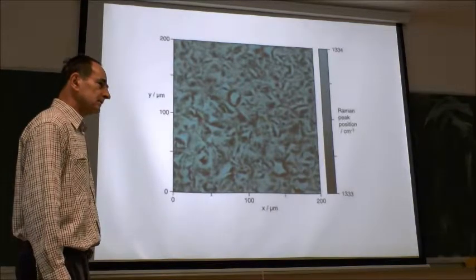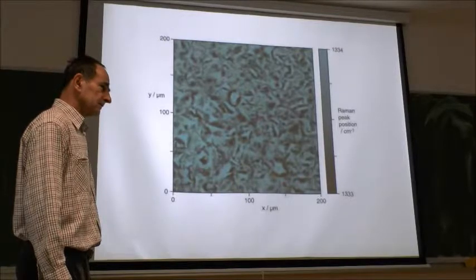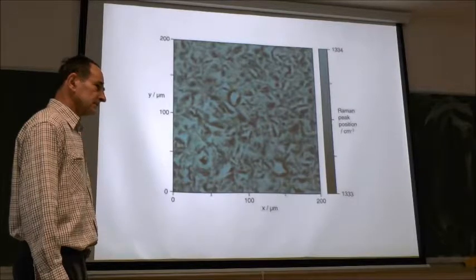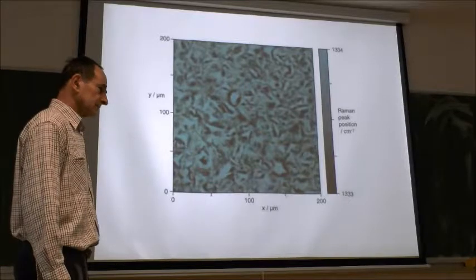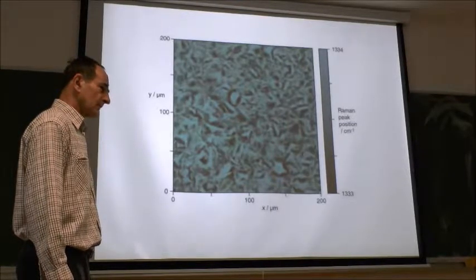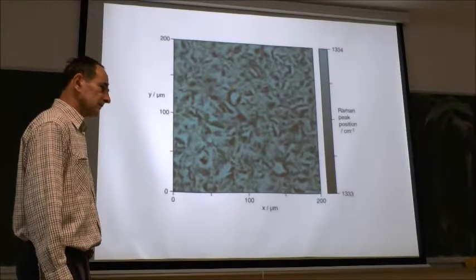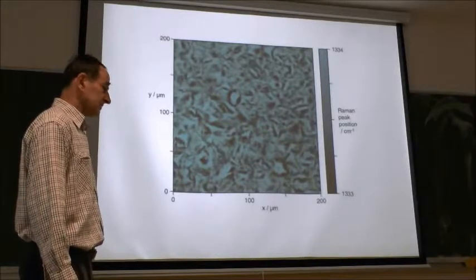Suppose you have a heterogeneous sample that is composed, not necessarily of different material, but rather a shift in the Raman bands, and it is arranged in space of, let's say, 5 to 10 microns spatially. Would that instrument be able to see the variation in the Raman band on that level? Yeah, there's definitely.